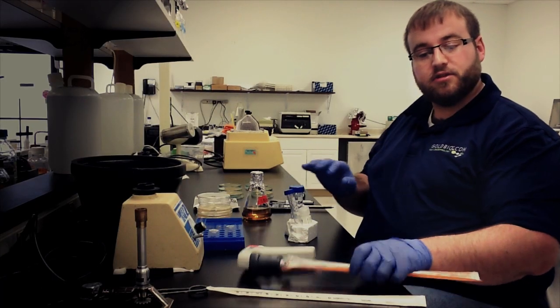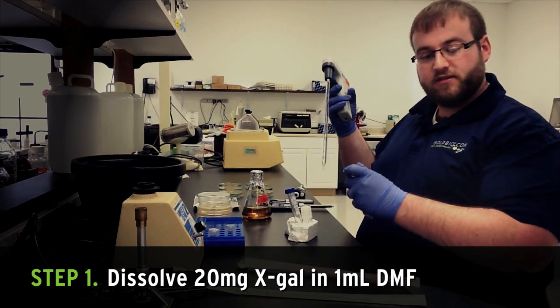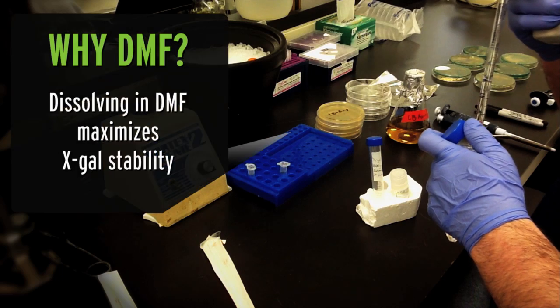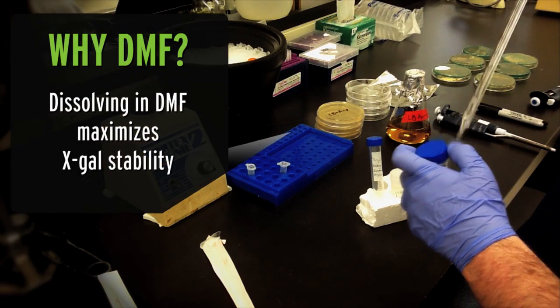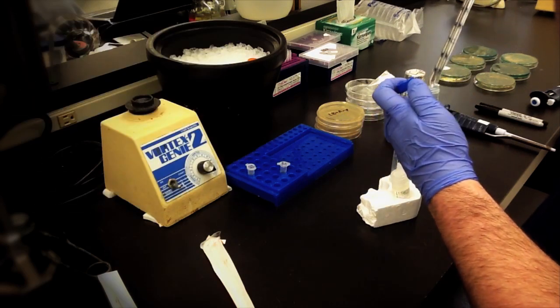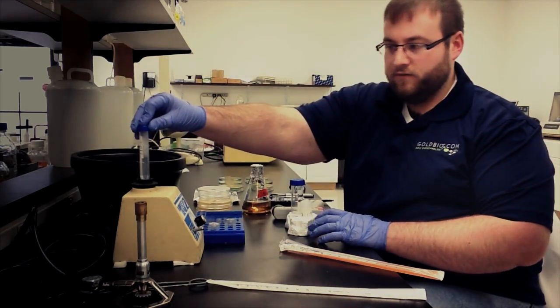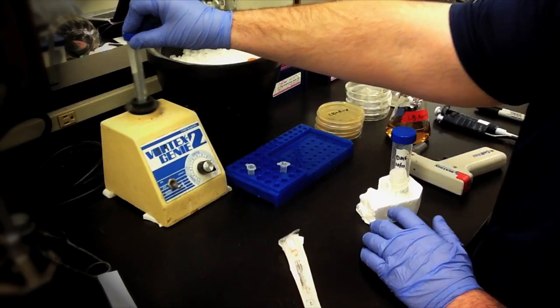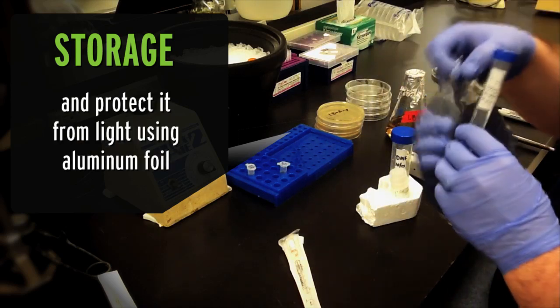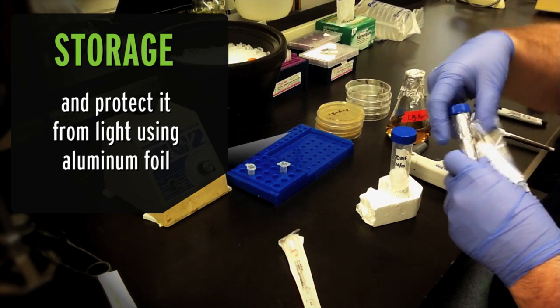To make your X-Gal stock solution, dissolve 20 milligrams of X-Gal in 1 milliliter of DMF. While X-Gal will dissolve in other solvents, we strongly recommend DMF for maximum product stability. Vortex to dissolve, and then store the solution at minus 20 degrees and protect from light by wrapping in aluminum foil, especially if your freezer is opened a lot.